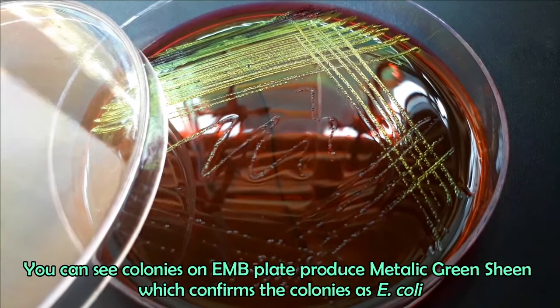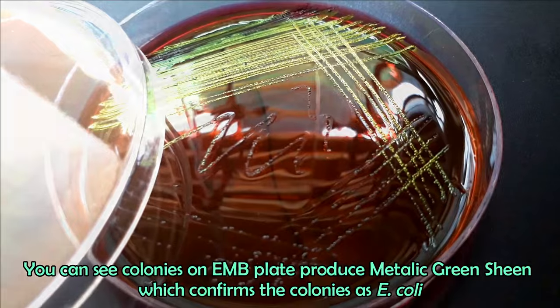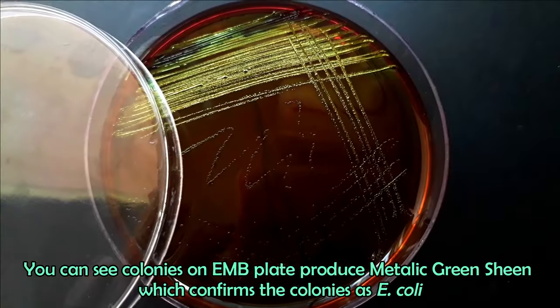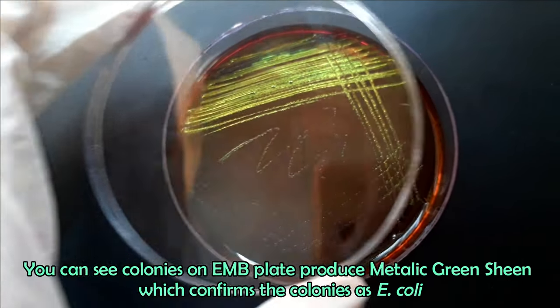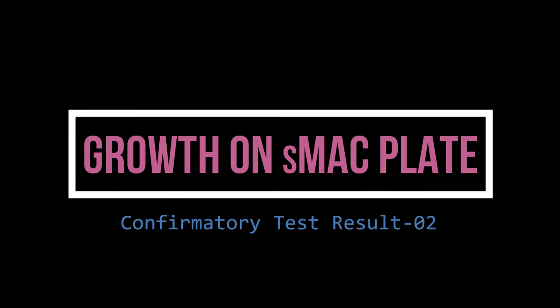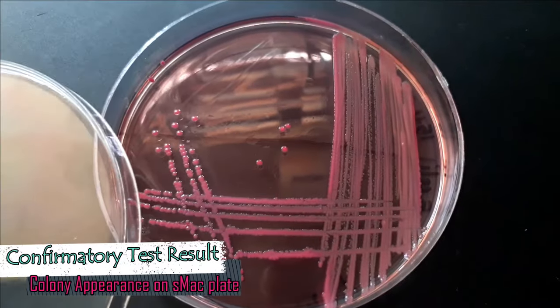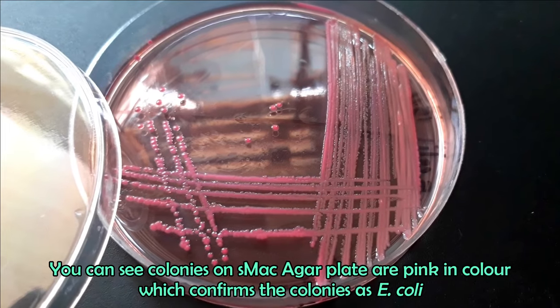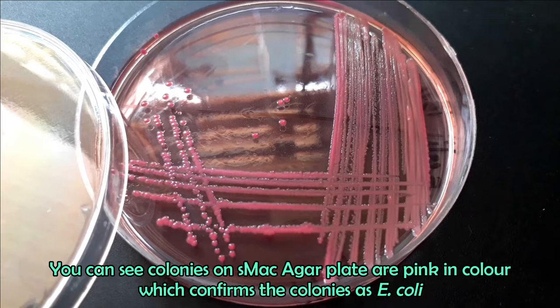E. coli gives metallic green sheen on EMB agar plate, so metallic green sheen on EMB plate confirms the presence of E. coli. E. coli gives pink colonies on SMAC agar media. So, pink color colonies on SMAC agar plate confirms the presence of E. coli.